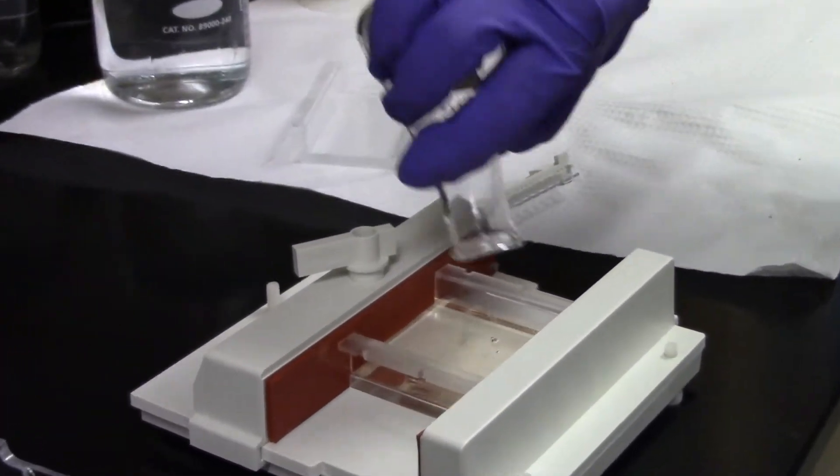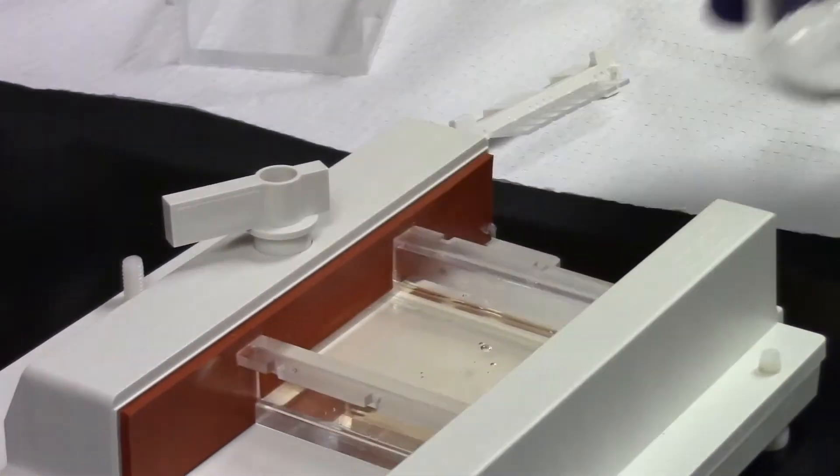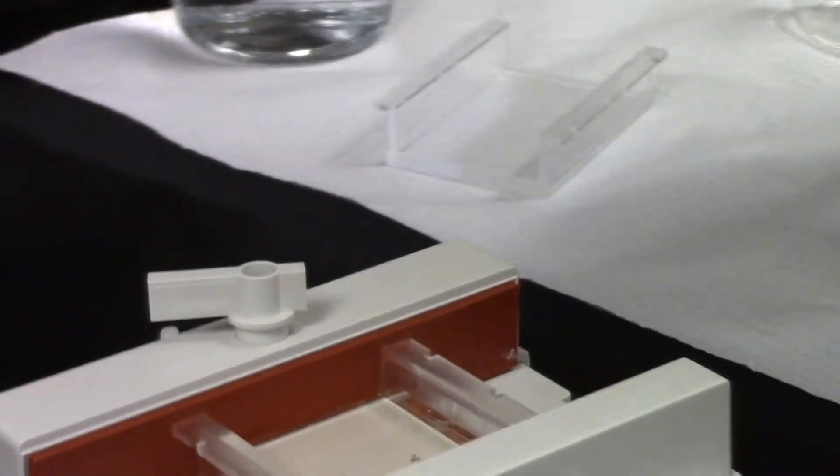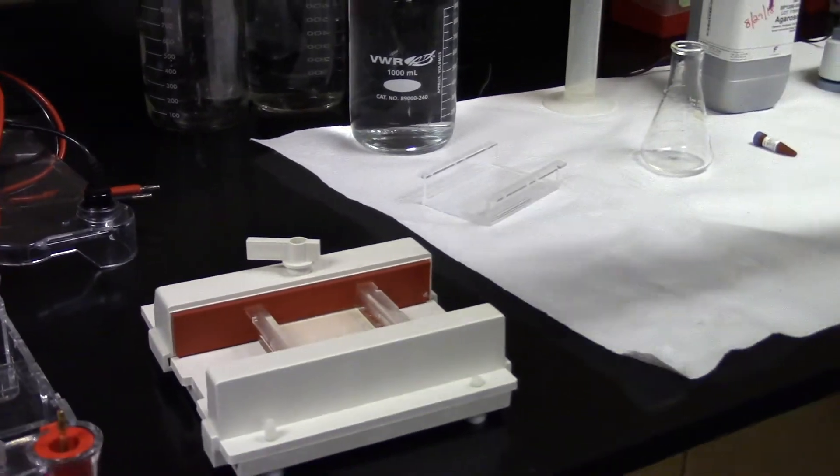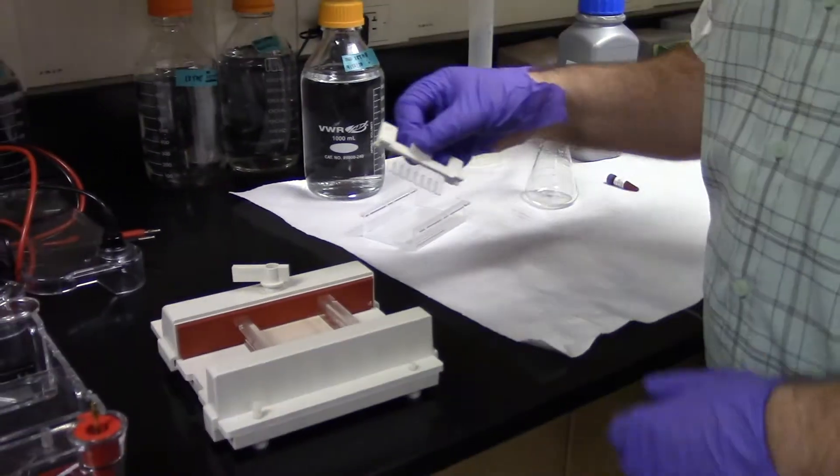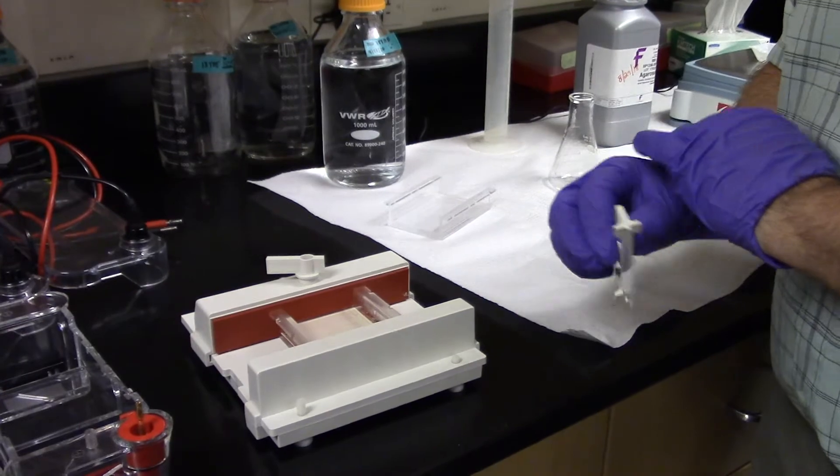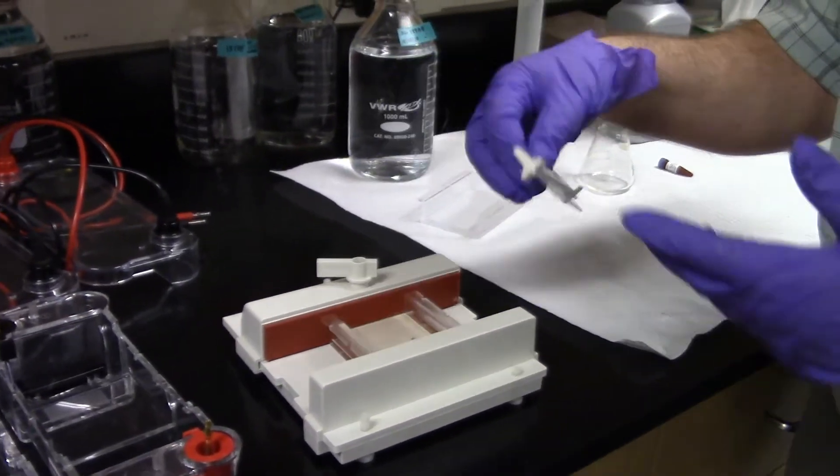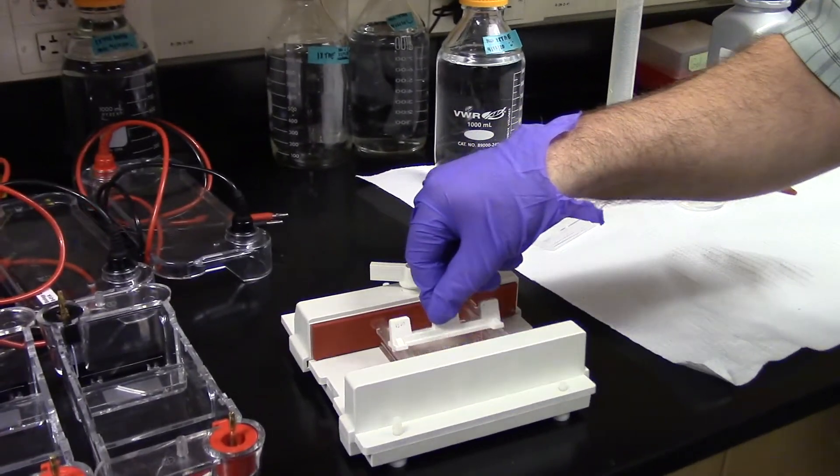And before it cools enough to become completely solid, like making jello, which is just gelatin fibers melted to make polymers. And when it cools in the fridge, you get a gel. We're making a gel here.